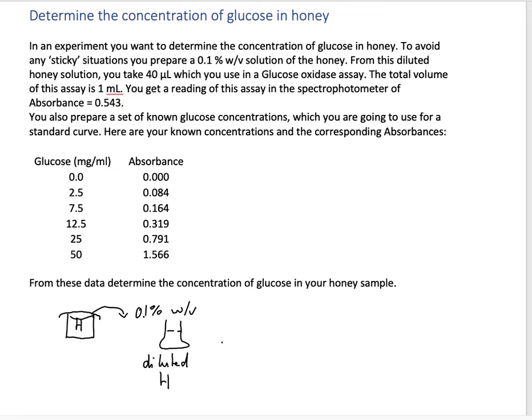From this diluted honey solution, we take 40 microliters and add it to a cuvette. This gives us a total volume of 1 milliliter. Then we perform our spectrophotometric assay.